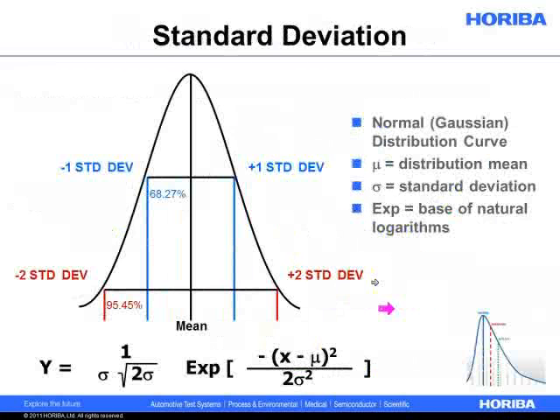So let's move on to ways of describing the width of the distribution. We described 5 different ways of describing points inside the distribution. Now if we were going to be looking at the width, one common one is to look at the standard deviation. There are some industries, some applications where you'd want to look at the geometric standard deviation as well. I know that's very common in the paint and pigment industry.